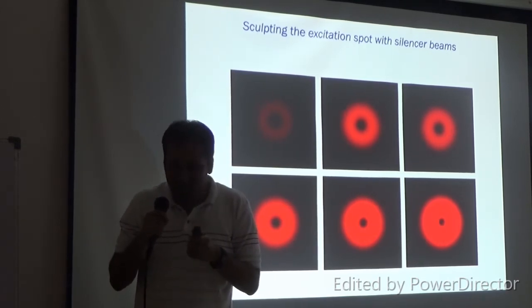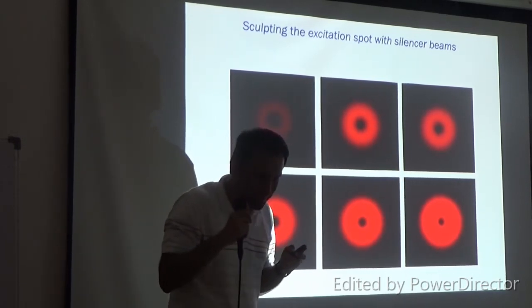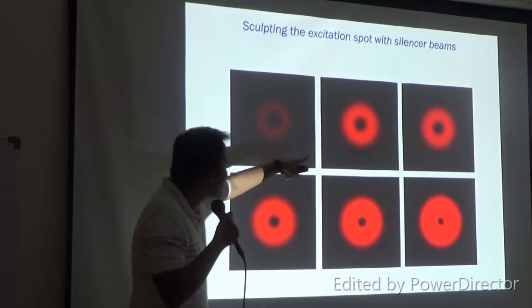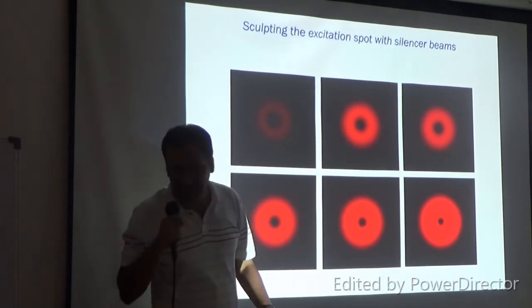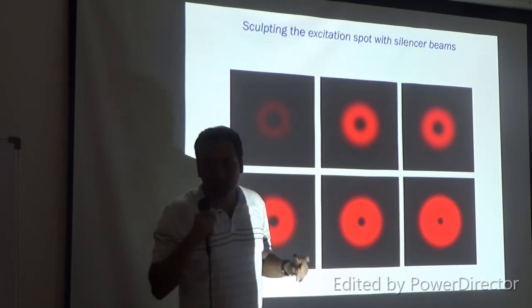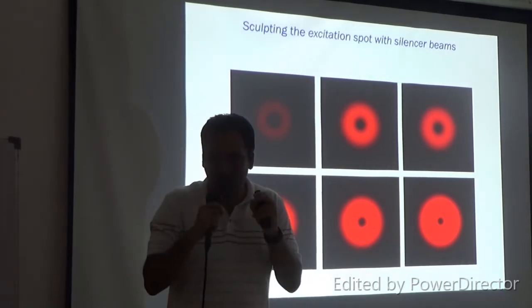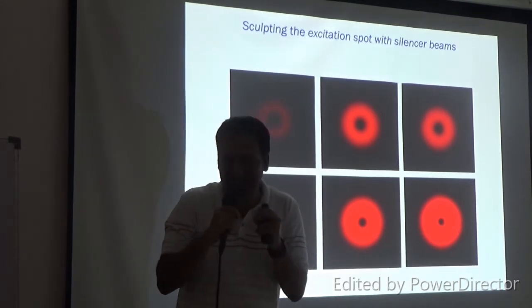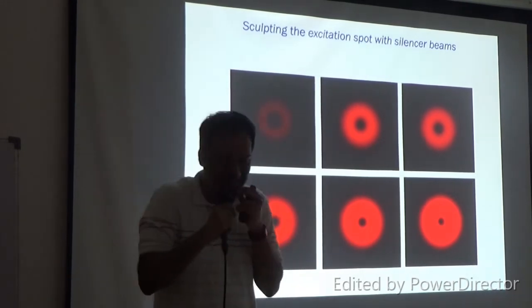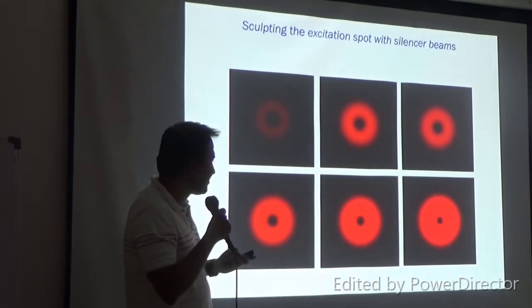But it requires a lot of red photons for it to kick back. Whatever gets to the excited state in this zone will be kicked back to the ground state immediately, and we may emit a red photon of the same wavelength as this one. It's not green, it's a red photon, right? What you are trying to detect is the GFP, which is the green photon. So this is an orange-red 580 nanometer photon.